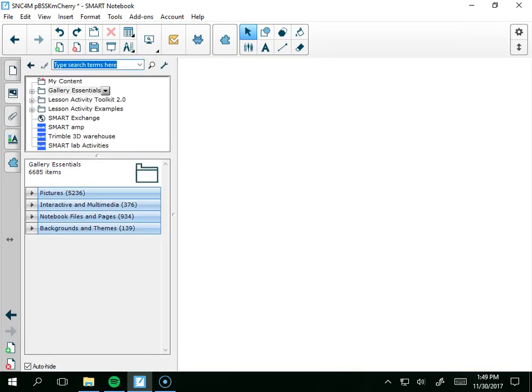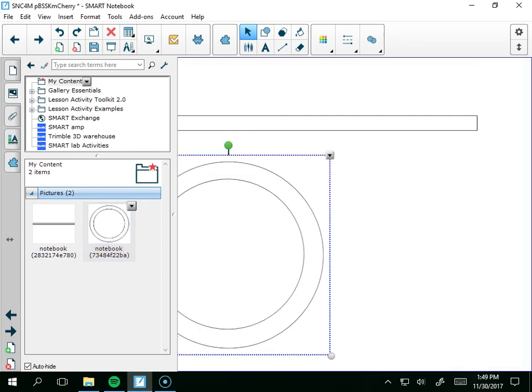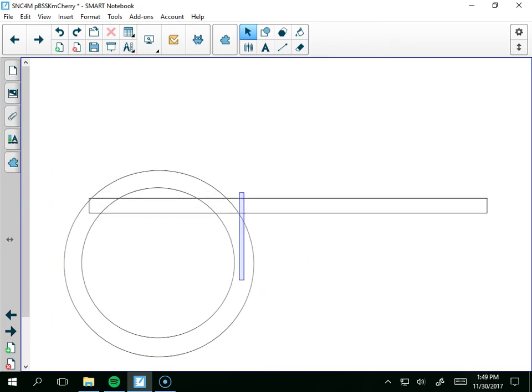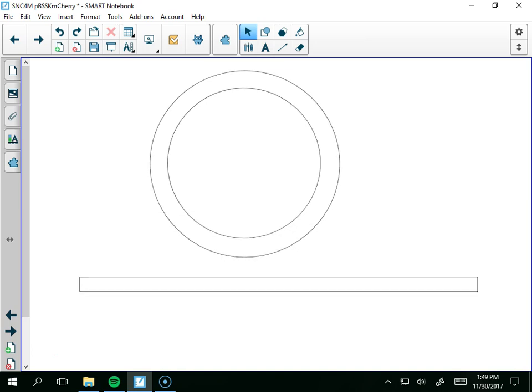All right. Let me get my pieces. Okay. So there's my insert map. There's my gene map, or my plasmid map, I should say. We can kind of redo this a bit. Oops. So it's a bit cleaner.